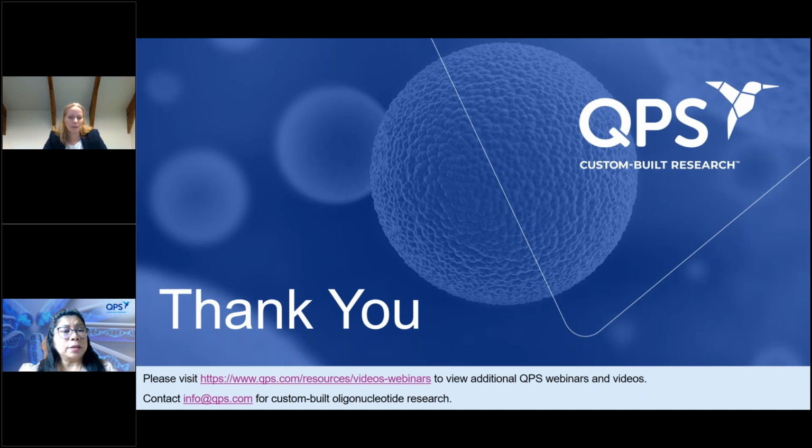Okay. And do you centrifuge the tissue samples before running samples by hybridization ELISA?